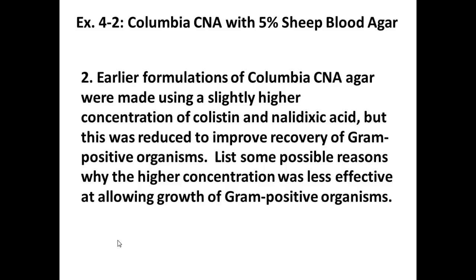So anything in too high of a concentration can be toxic. In this case, we're trying to kill off gram negatives, and we don't want to harm the gram positives. But if the concentration is too high, we could affect the gram positives as well. And so what effect would this have on our plates? What are some possible reasons?